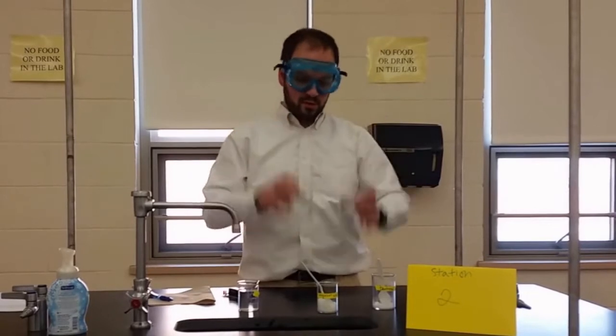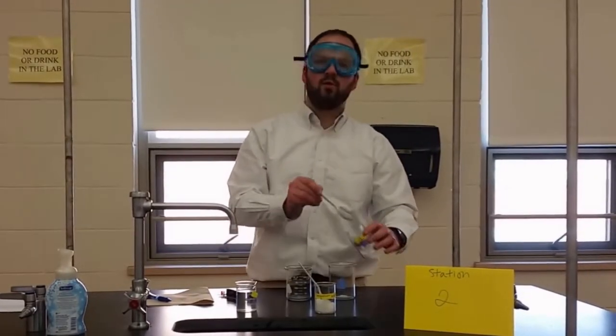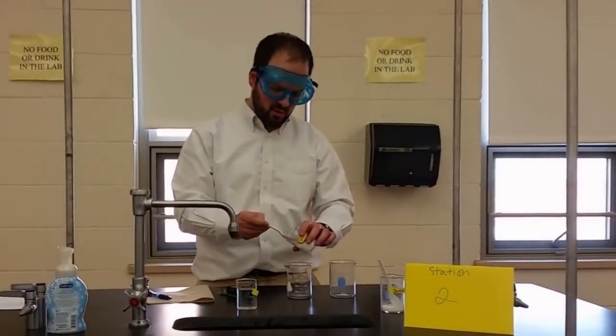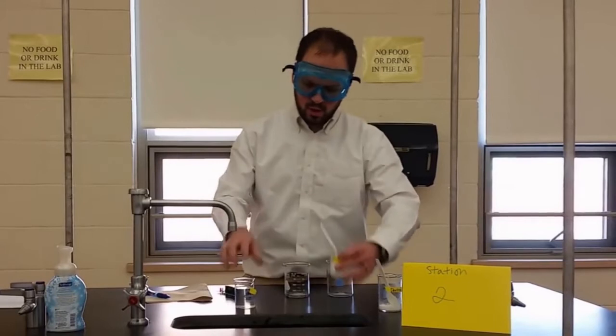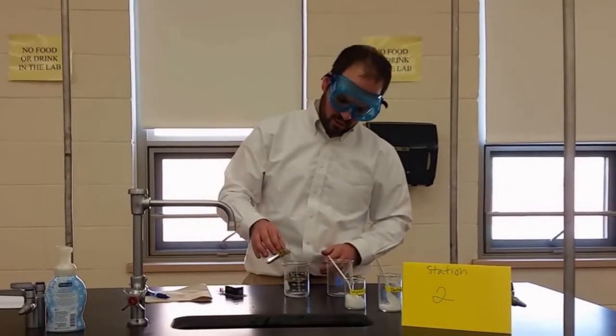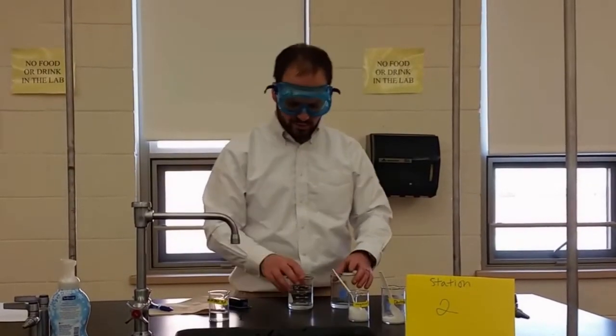Then we're going to take our 2 beakers that are at our station, and we're going to scoop a very small amount of one chemical in one, doesn't take a lot, and then a very small amount of a chemical into the other. We're then going to put some water in. We only need about 1 centimeter of water, about a ½ inch in each one. And you're going to swirl to mix.